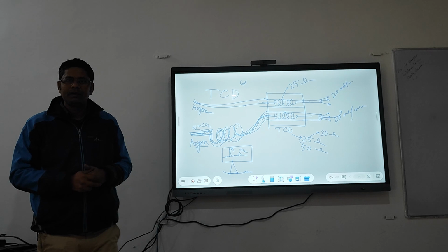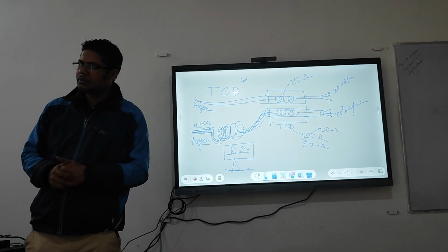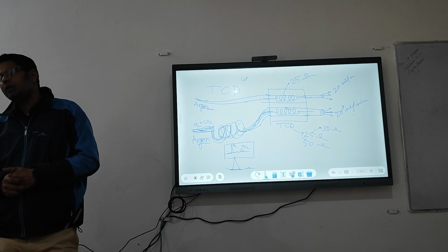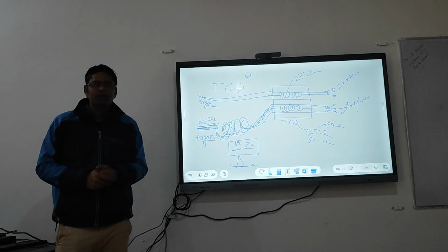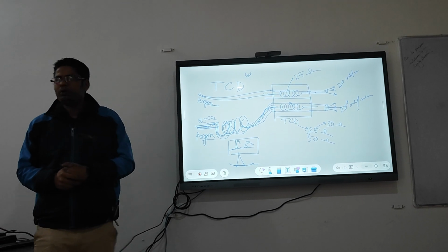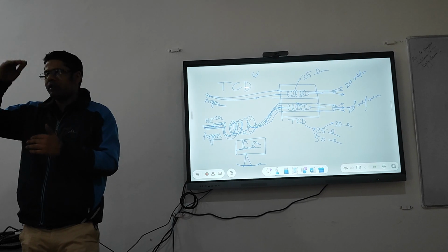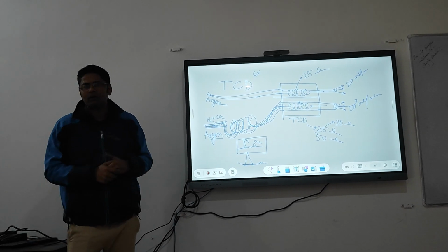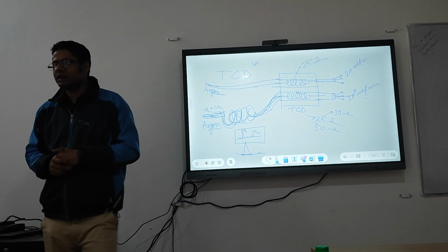less. But a saturation point will come. You cannot increase beyond that maximum limit. So we have set the instrument up to 100% and it should not saturate. That will be within frame. Nowadays all GC systems are equipped to sustain 100% without saturation.